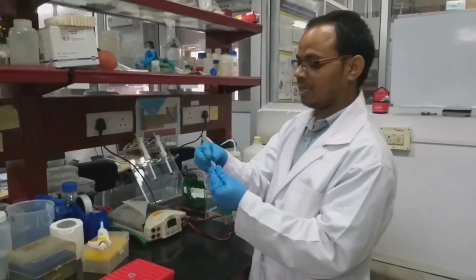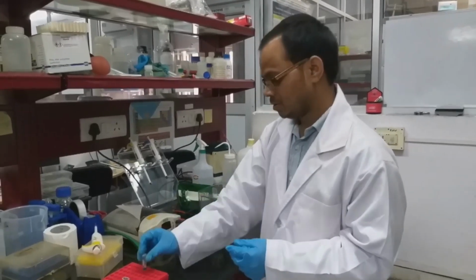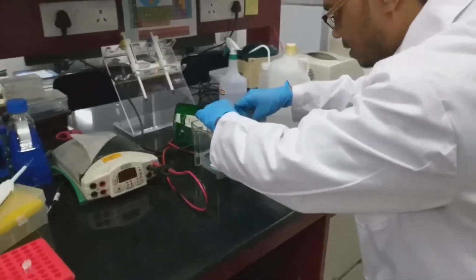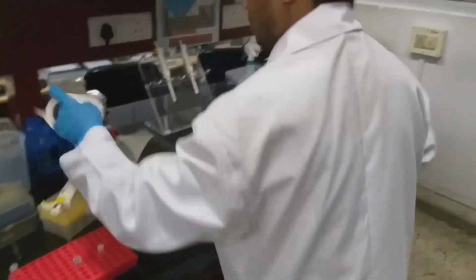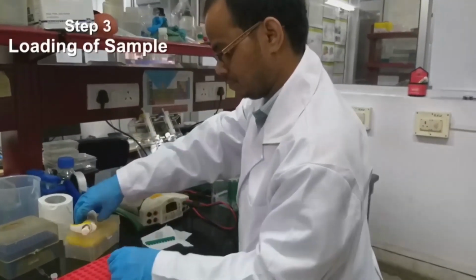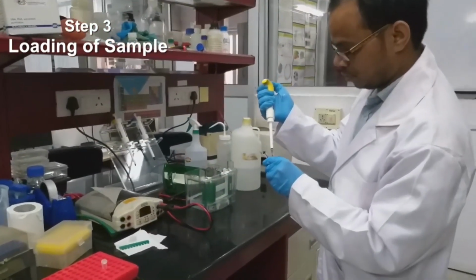The protein samples are ready. We heated sufficient time. Now we have to load this. So we have to remove the comb carefully. Then first I am going to load the marker or protein ladder.